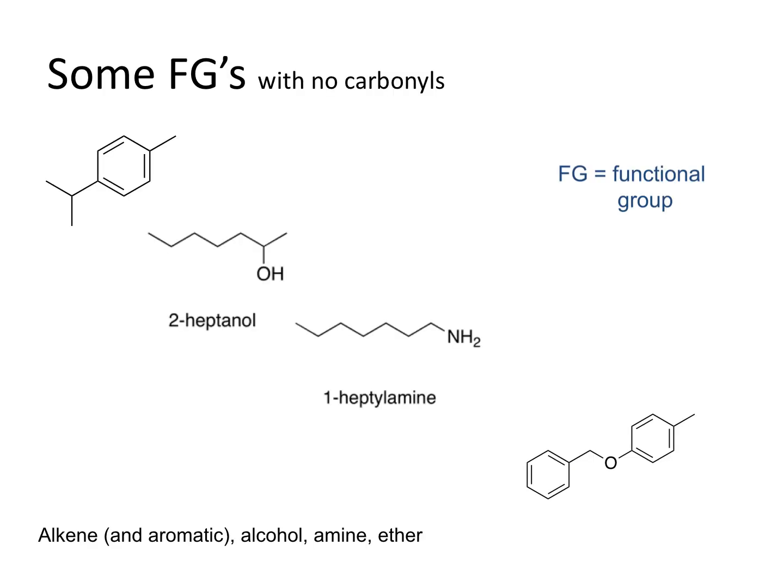Just as a quick recap, in part 1 of the series, we saw a brief introduction about what spectroscopy is and how it works with molecules, and also we talked about IR specifically, and what kinds of peaks you should look for on your IR spectra to try to confirm the identity of some sort of molecule. Some of the functional groups we already mentioned are shown here. These are in the previous video. These are for the functional groups that don't have carbonyls. Now we're going to see the functional groups that do have carbonyls. At the end of this video, you should know all the possible peaks that you might need and be able to complete your assignments.